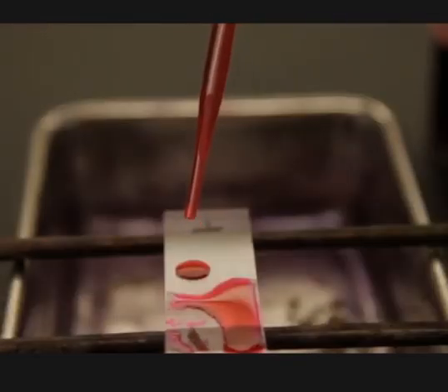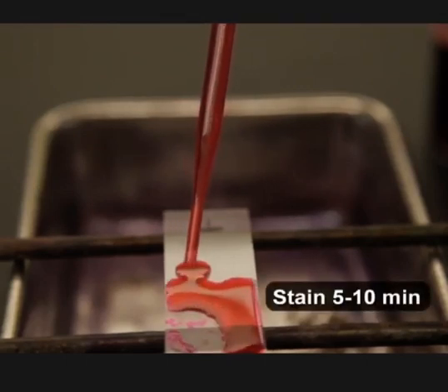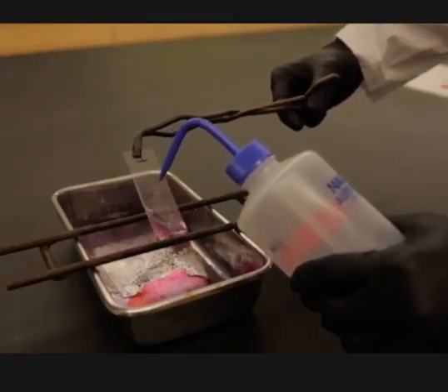Allow the slides to stain for 5 to 10 minutes, taking care to add more dye as needed to keep the slides wet. Gently rinse the slides with water to remove excess stain and allow the slides to dry at room temperature.